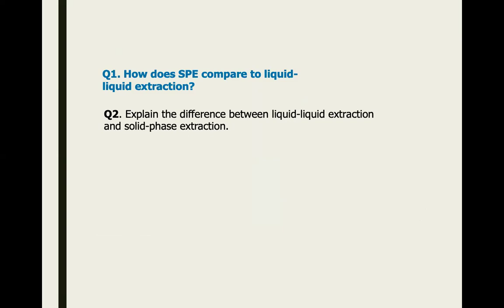There's a lot of food related, functional food that we consume, probably some herbs, probably some additional food that you think is beneficial. The extraction procedure uses organic solvent, and it is known that hexane is accepted as safe for food extraction.